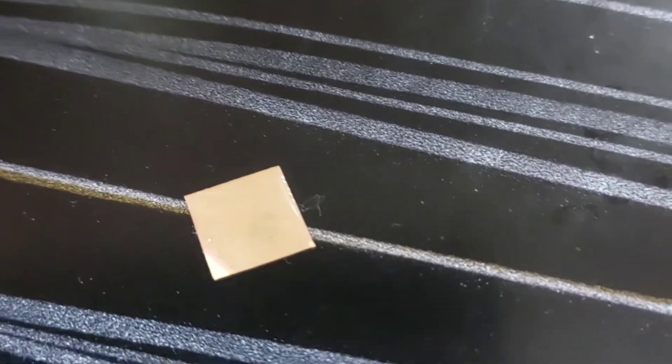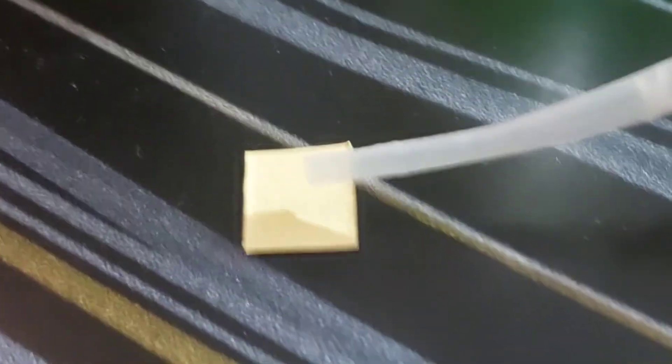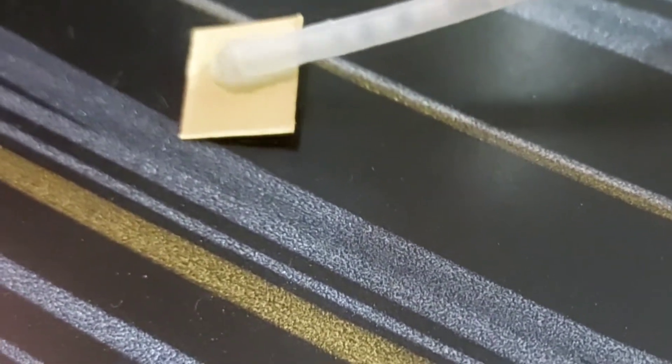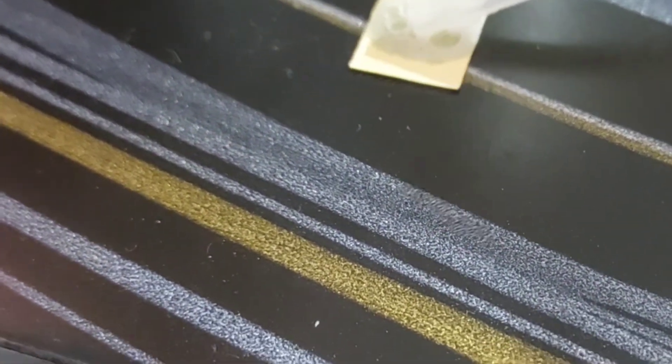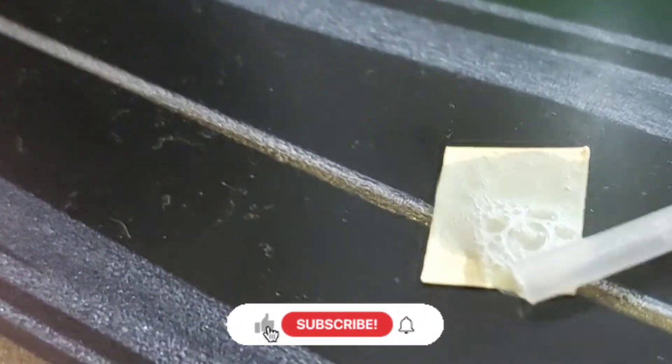Now I have the same paper and I'll put soap water on it. As you can see, it is converted into light blue color, which means it is a weak base. Actually, it was stuck to the paper—that's why I wasn't able to show you properly.